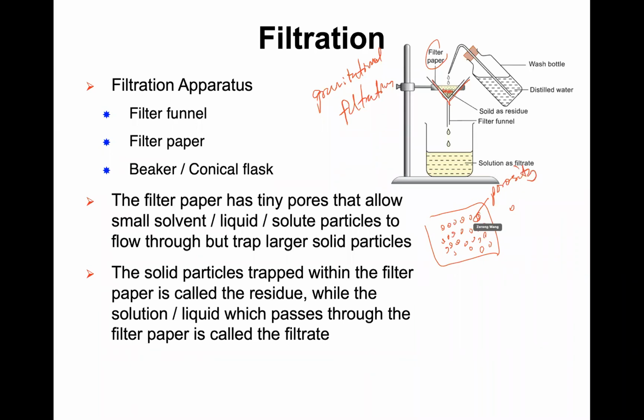And this one, we will talk about how much can stay on the paper. If the particles are smaller than the diameter of the holes, certainly those particles can pass through along with the liquid, right? Now, if the particle has a diameter bigger than the hole, no matter what, it will not pass through. Anyway, you cannot use your naked eye to see these holes, because those holes are very small.